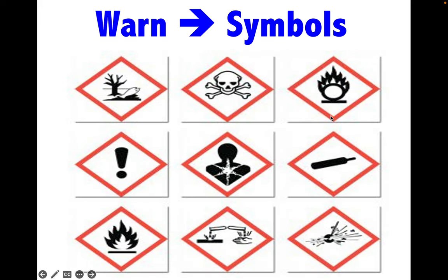You can also warn others about potential hazards from chemicals using these symbols, which you need to know the meaning of each. For example, the chemicals may be: environmentally toxic, dangerous to health, reactive/oxidizing, irritant, respiratory toxic, corrosive, flammable, and explosive.